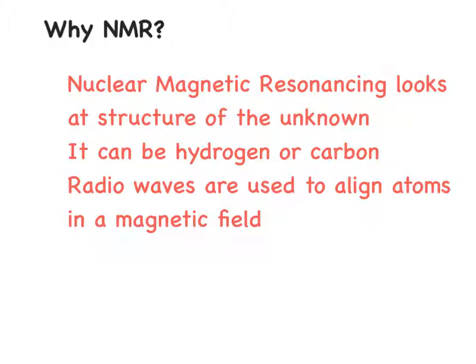I've already gone through spectra with you. Now, what we do is we use nuclear magnetic resonance to look at the structure. This helps us work out the structure of very, very complex molecules. In some cases, they not only look at the way hydrogen behaves, but also how carbon or some other element behaves.